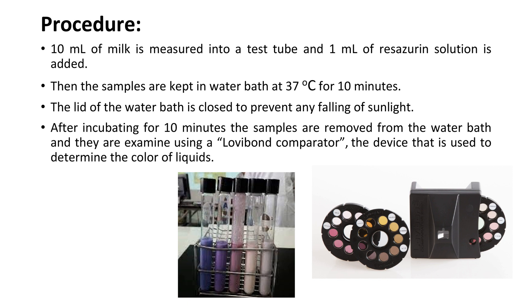After incubating for 10 minutes, the samples are removed from the water bath and they are examined using a Lovibond comparator, the device that is used to determine the color of liquids. Here you can see the Lovibond comparator and the color changes of the samples during the bacterial activities.